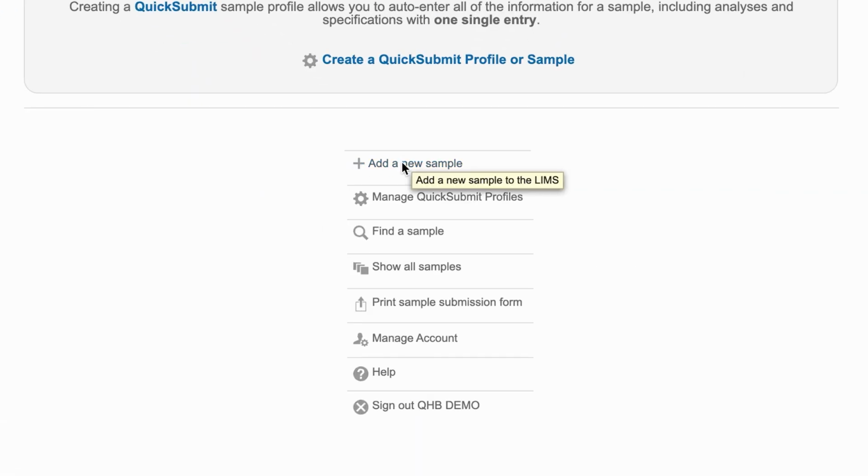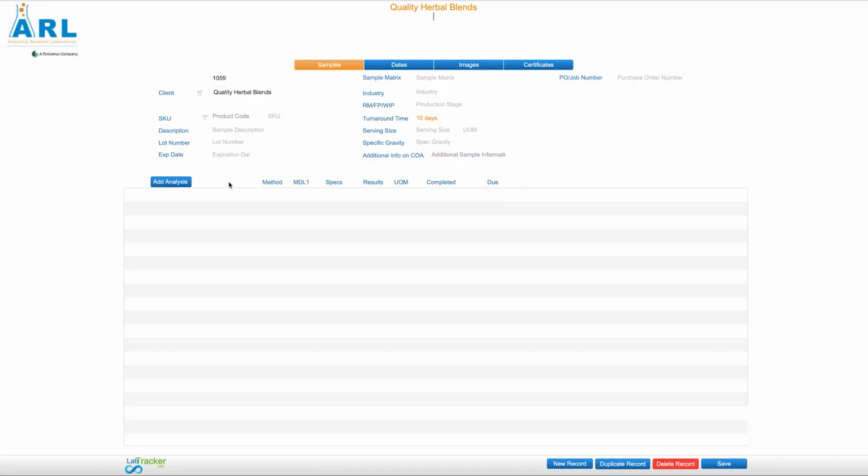Hey team, in this quick video we will go over how to input samples in Lab Tracker. To start, click Add a new sample. This will create an ARL record.